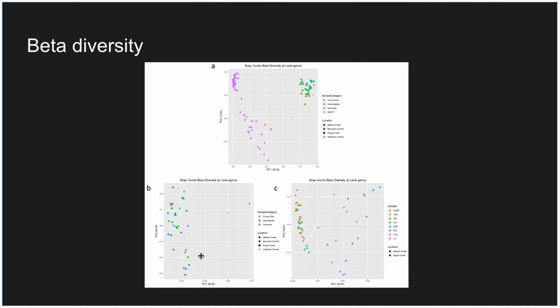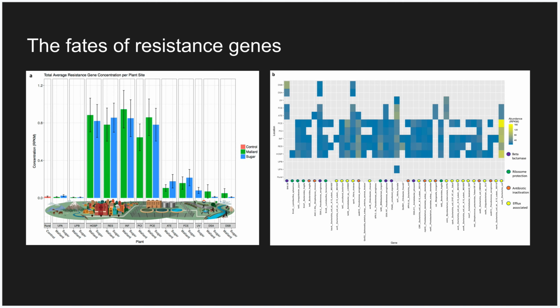And if we break them down, then you begin to be able to see that there is some difference in the way the aeration tank effluent clusters as opposed to post-treatment water. So we have the during treatment and then the post-treatment samples kind of separating out in this one. So that's the basic gist of what we saw.